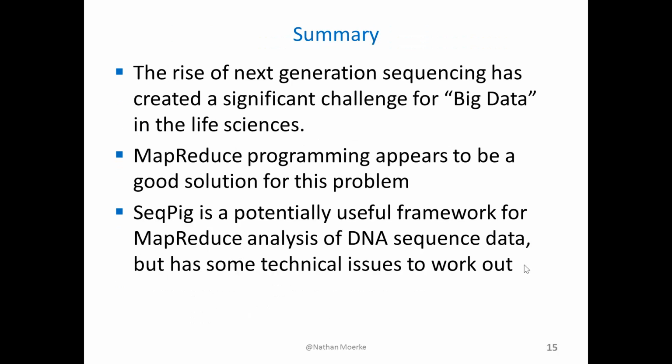To summarize this demo and the project, what I'd like you to take home is that the rise of next generation DNA sequencing has really created a significant challenge for big data analytics in the life sciences, and that MapReduce programming platforms are potentially a very good solution to this problem, as they're very scalable for large data sets and large files. And DNA itself is readily amenable to MapReduce analysis, as you can easily divide a long DNA sequence into smaller, more bite-sized chunks for analysis.